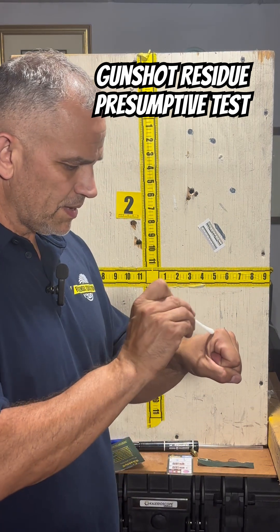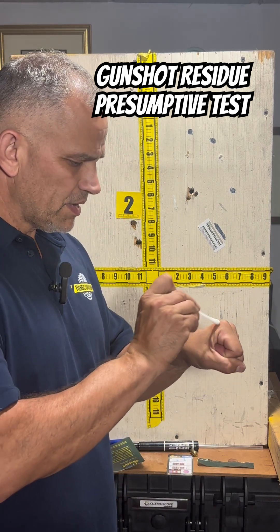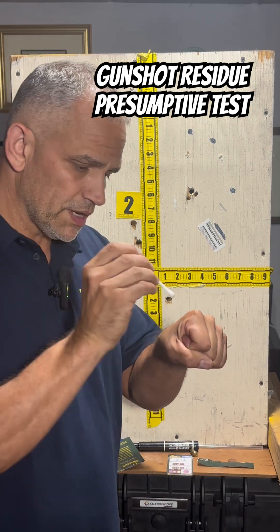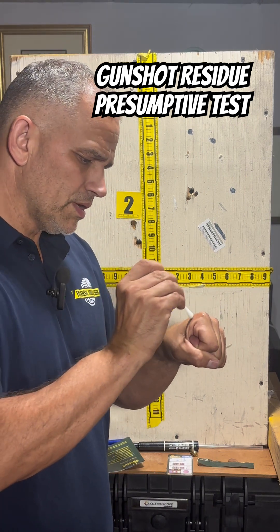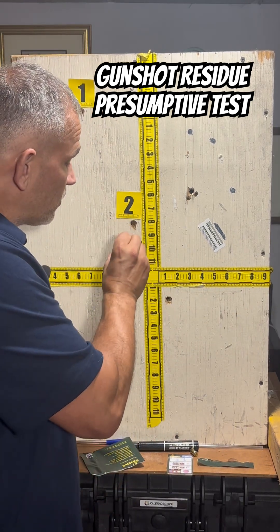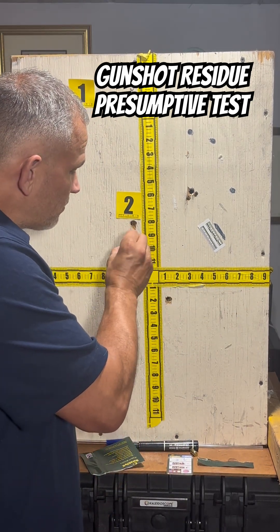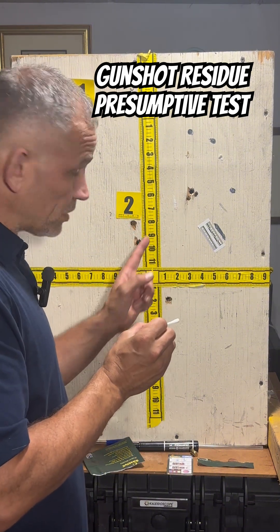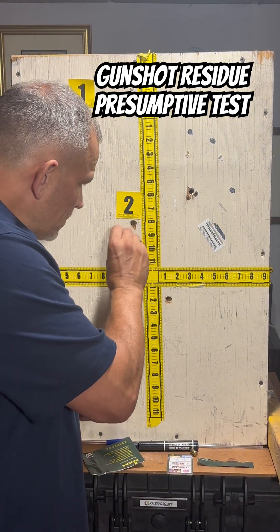I'm going to use my hand and see if I have any gunshot residue. I'm using the tip — it's very important to use the tip. If you had a bullet hole in a wall that you thought might have gunshot residue on it, maybe you didn't know if this was a bullet hole or not, you could swipe it like this.